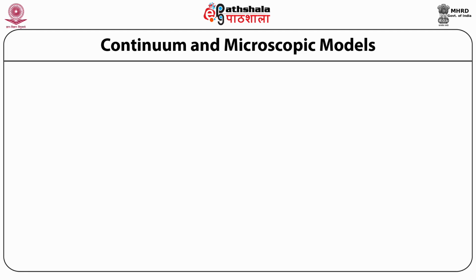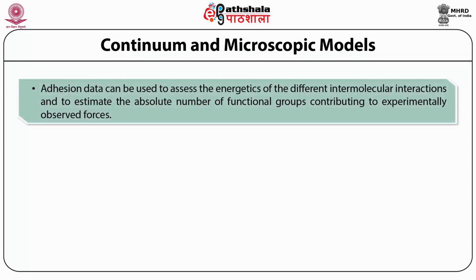Continuum and microscopic models, which has been given in this slide. Adhesion data can be used to assess the energetics of the different intermolecular interactions and to estimate the absolute number of functional groups contributing to the experimentally observed forces.